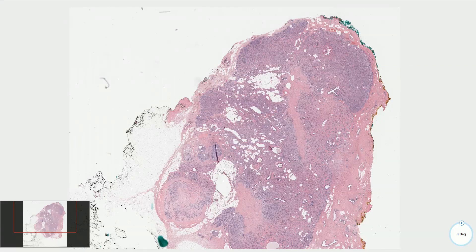Adenomyoepithelioma is an uncommon benign tumor of the breast which consists of two components: myoepithelial cells and epithelial cells. The lesion is well circumscribed and typically has a fibrous capsule on the periphery, with no infiltrative or invasive type of growth.